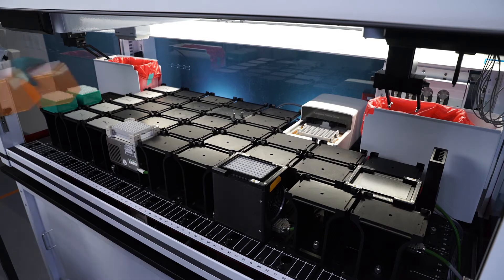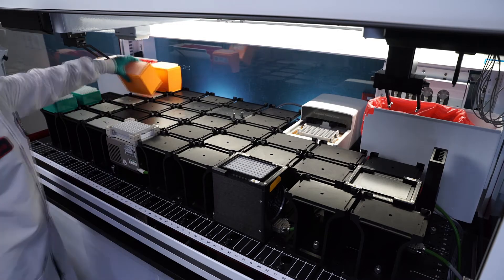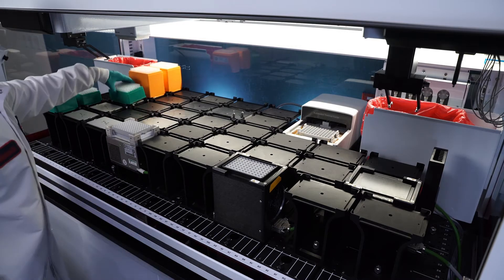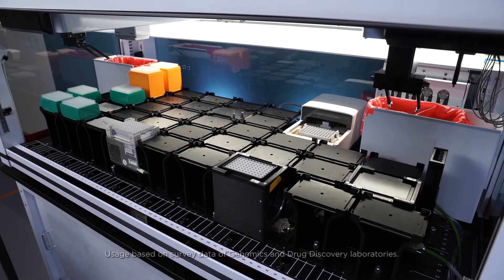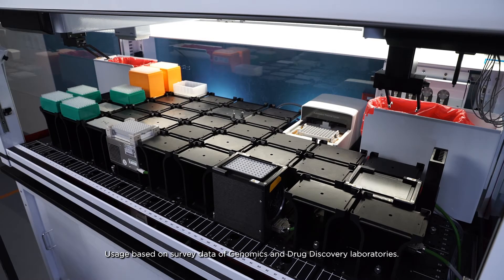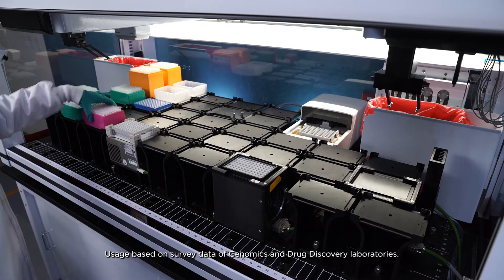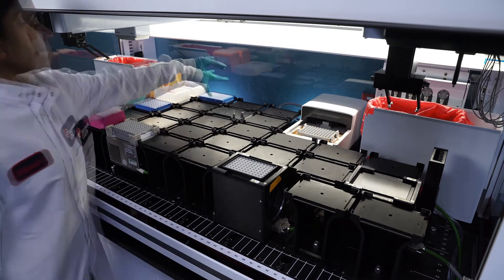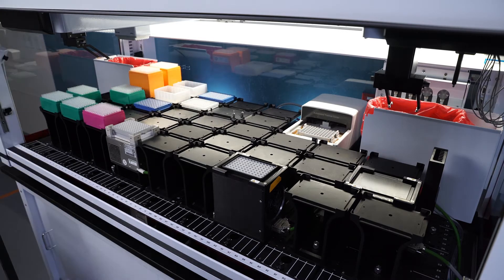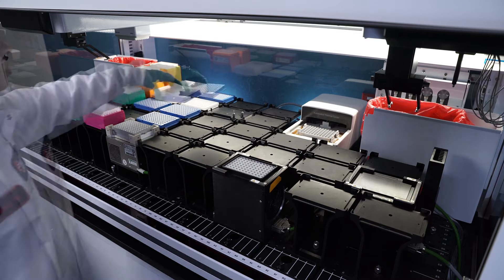Over the life of your Biomek i-Series liquid handler, you and your team will place tens of thousands of pieces of labware on deck. How often will a mistake be made? What will it cost your lab?